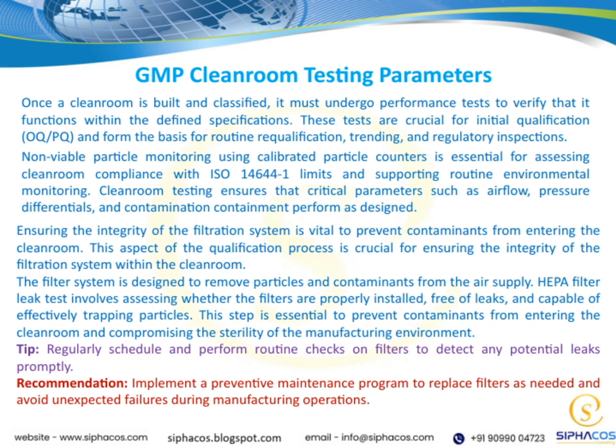operations. Once your cleanroom is built and classified, it's important to conduct performance tests to verify that it functions within the specified parameters. These tests form the foundation for initial qualification, whether it's operational qualification or performance qualification, and they also support routine requalification, trending, and regulatory inspections. Monitoring non-viable particles with calibrated particle counters is a key part of this process. It helps ensure your cleanroom complies with ISO 14644-1 limits and supports ongoing environmental monitoring.